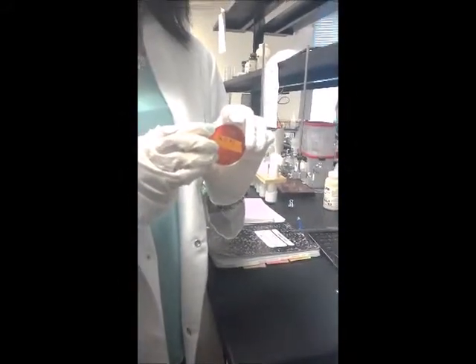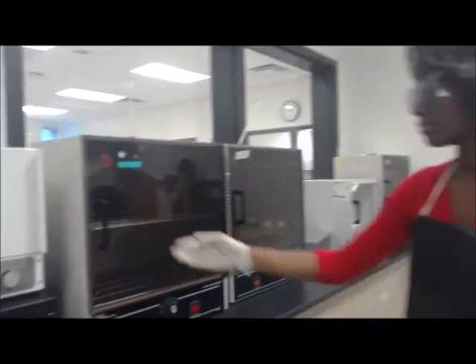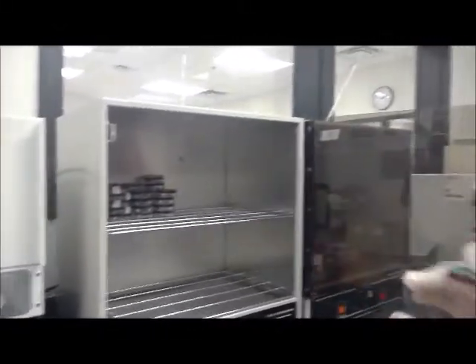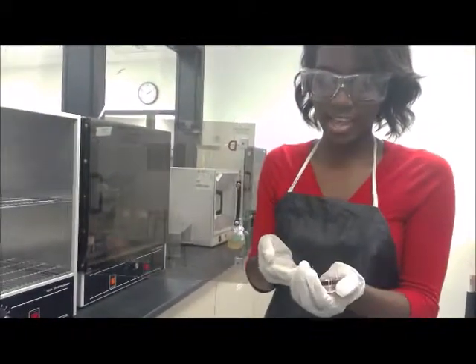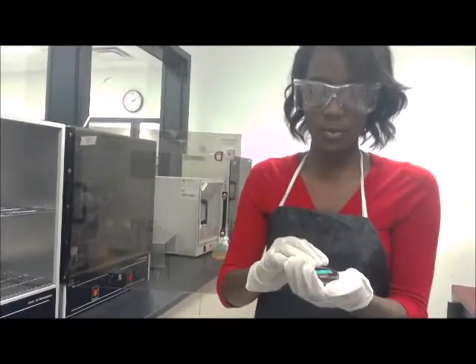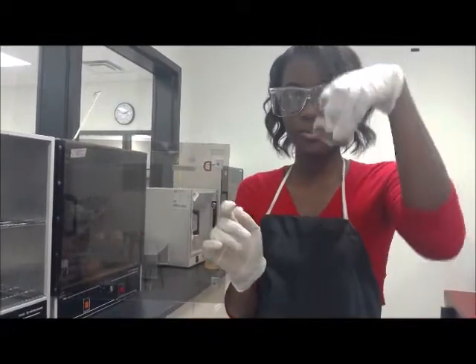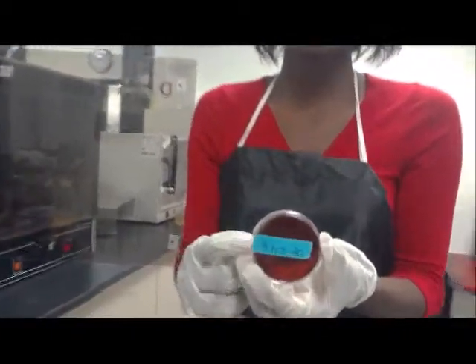Then we safely discard the swab and incubate the plate. We are going to tape them together individually so that they cannot come apart and keep the bacteria inside. We will label each one with the name and number of the participants.